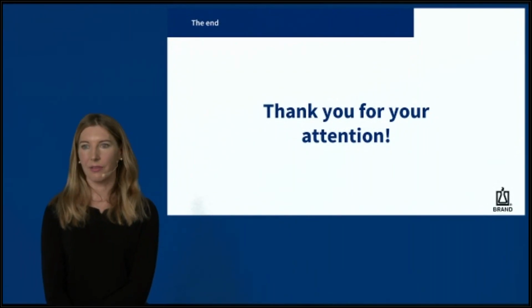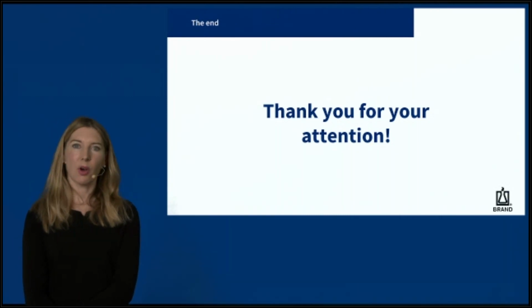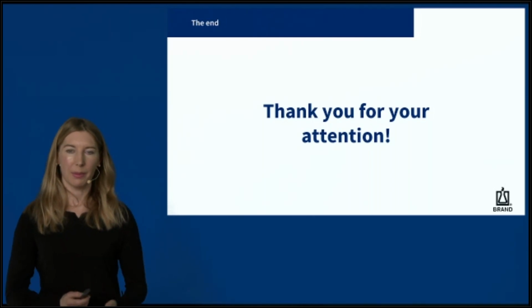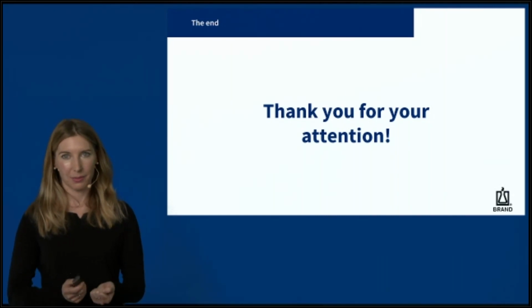This is really a very good question because, yes, it is most common in the labs that you do not use the original tips which are compatible with your pipette. And the pipette and the pipette tips are a matching system.